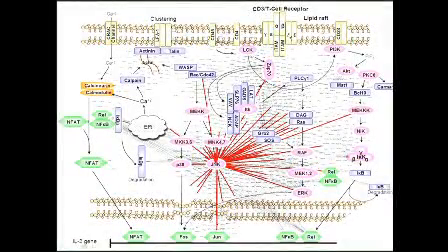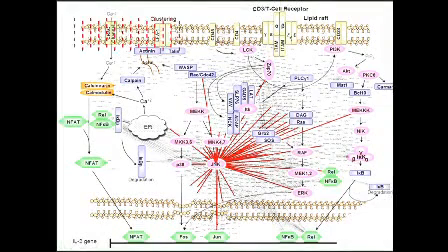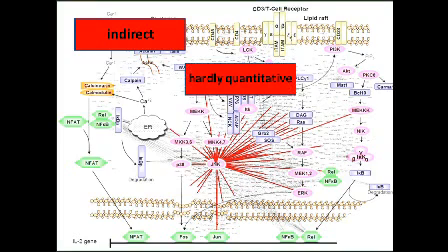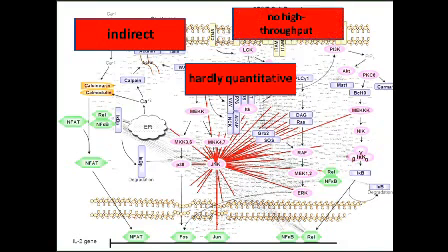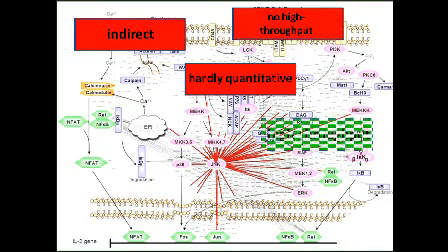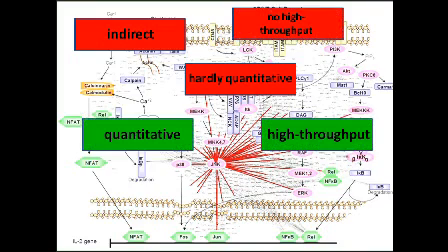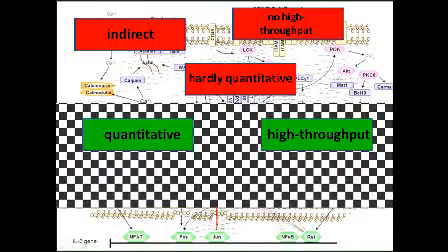The aforementioned techniques have been developed for recording large populations of cells, yet suffer from being rather indirect and therefore hardly quantitative. In contrast, a few high-end quantitative approaches were introduced. However, extending high throughput is difficult. To combine high throughput capabilities with the possibility of extracting quantitative information, we recently developed a new concept for identifying protein-protein interactions, the micro-patterning technique.